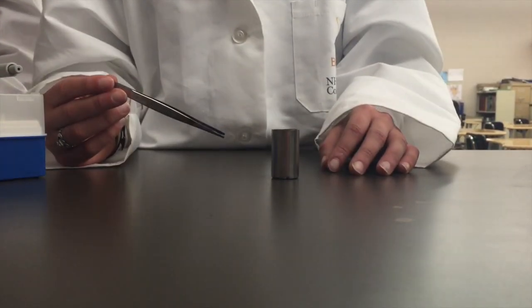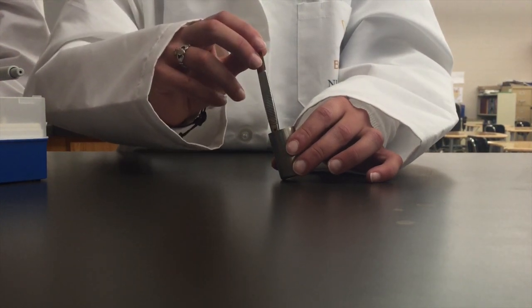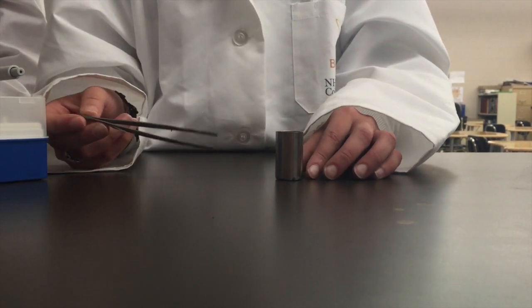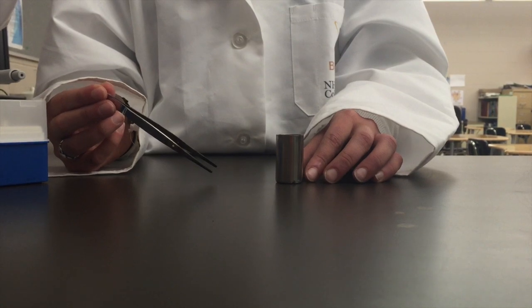Put the previously sterilized forceps into the media inside of the cap. You might hear a sizzle. This is normal and it indicates that the forceps are still very hot from being put in the flame. If this occurs, do not touch the bead because the heat from the forceps will kill the bacteria on the bead.